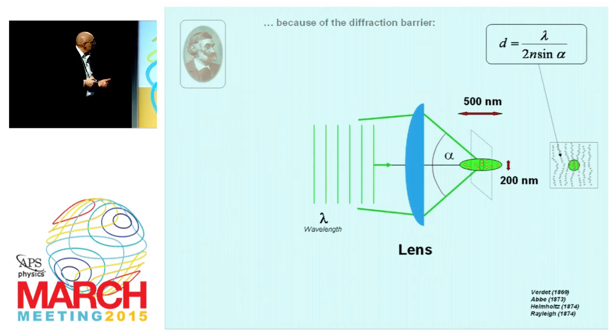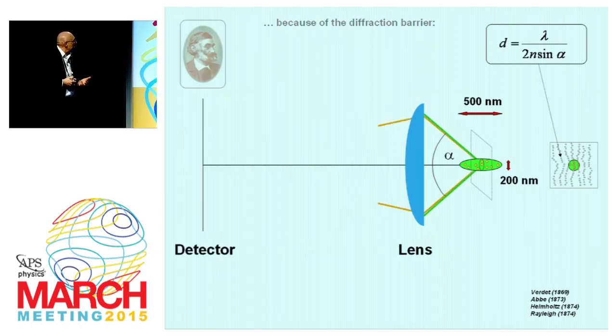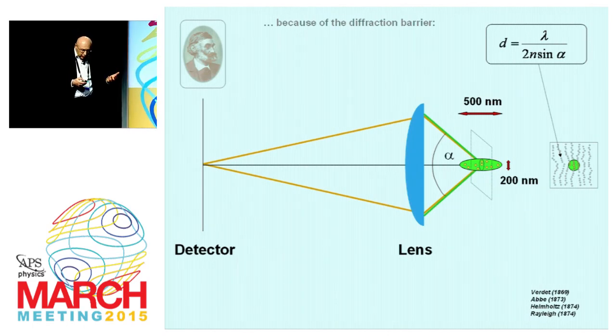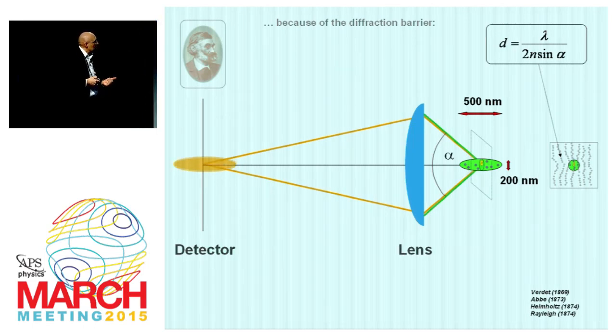And then, of course, they will also produce, say, fluorescent light or backscattered light basically at the same time. And so if you try to collect the backscattered light with a lens and focus it onto a detector, of course, we will have from each feature a blob of light that is also diffracted. And each of these features or molecules will produce light basically at the same time because they're flooded at the same time with this diffracted beam of light. And therefore, the signal will overlap at the detector.